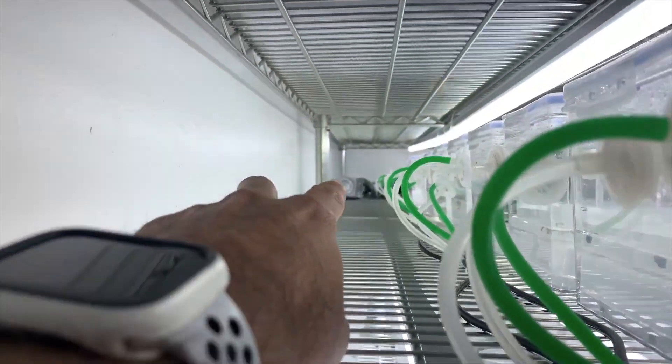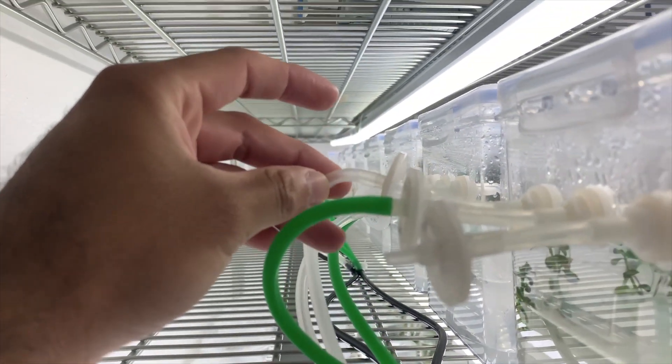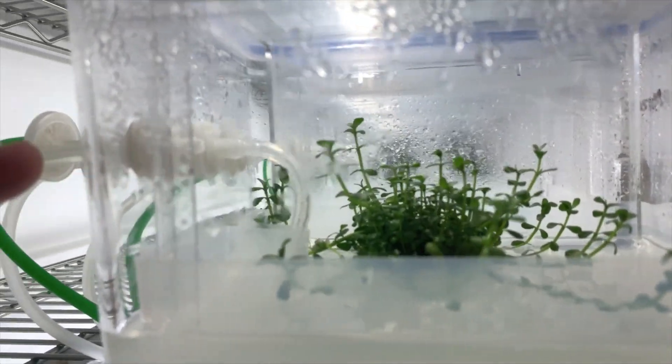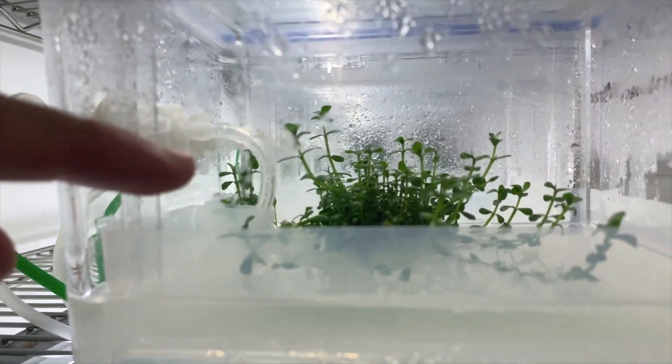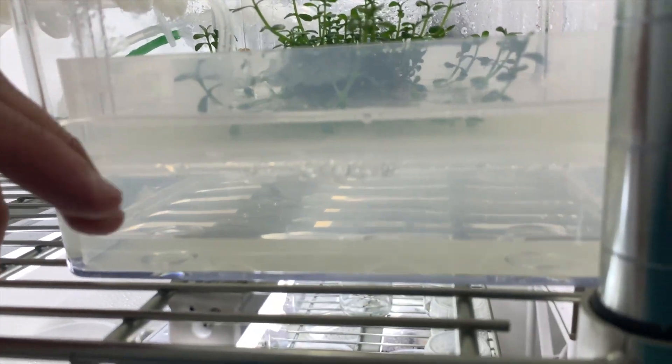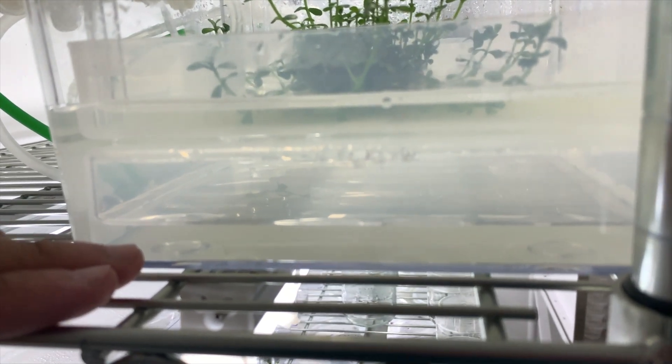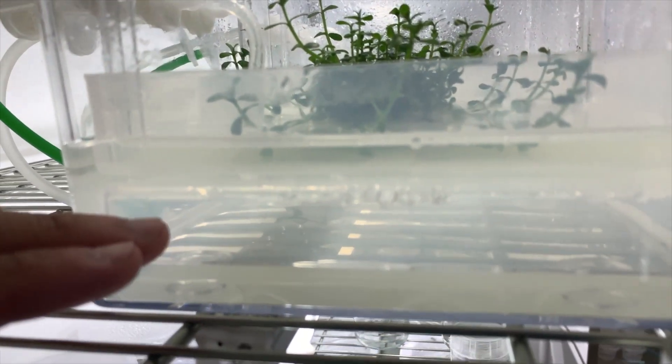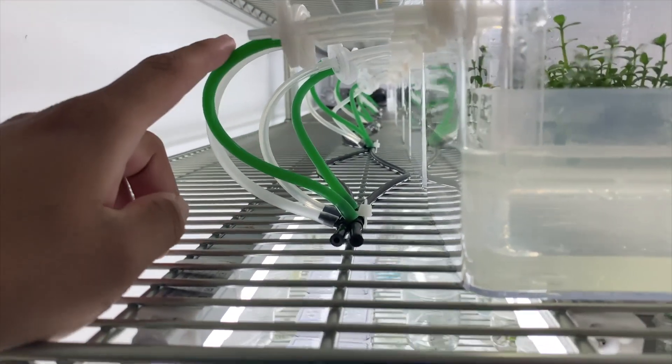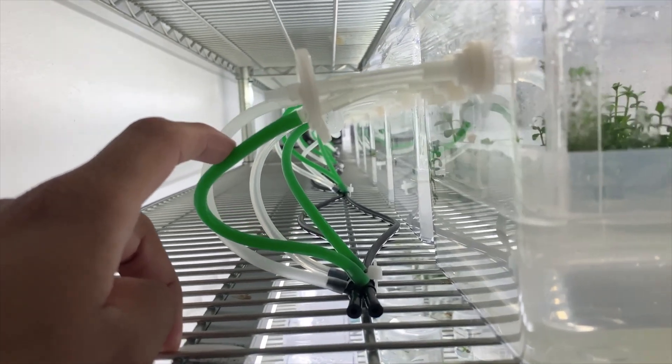So now that the other two pumps are on, air is coming to the other tube, which is pushing sterile air into the containers and pushes the media down. Now the air or the media is pushing air to the green tube back and escapes to the solenoid. That's why it uses a solenoid and it uses two aquarium pumps.